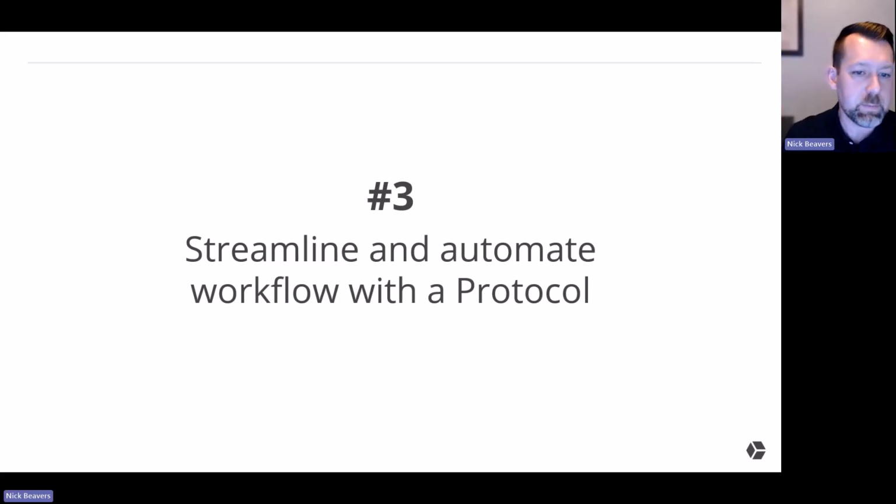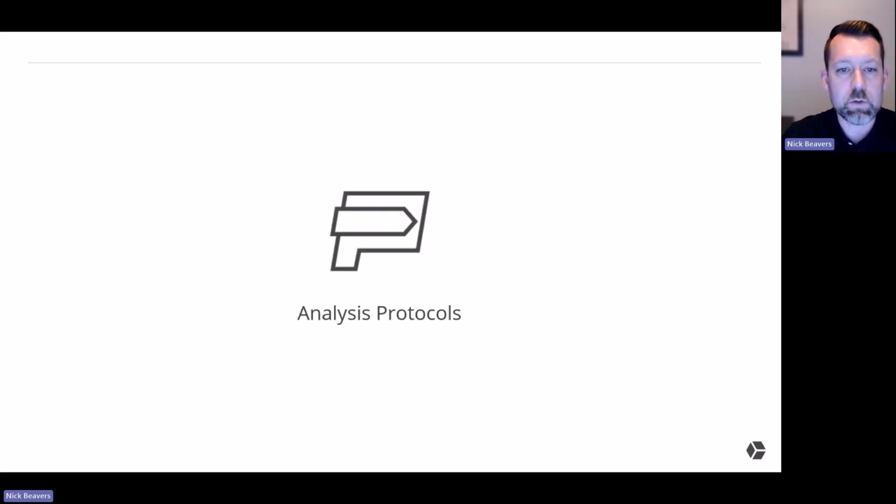Now, again, if you're not using imagepro, there's still familiar types of approaches here. There's a lot of other software that is available that will create a pipeline or a workflow or some kind of automation that will build steps in your experiment. Not everybody has it, but there are some out there. Instead of handling everything one step at a time or doing things in a very free-form manner, you can save a lot of time and a lot of energy by streamlining your entire workflow. So let's talk about that a little bit.